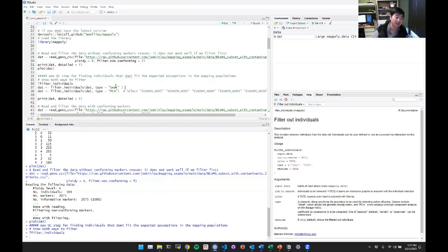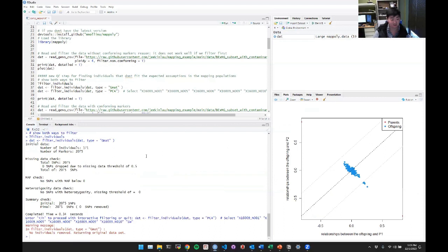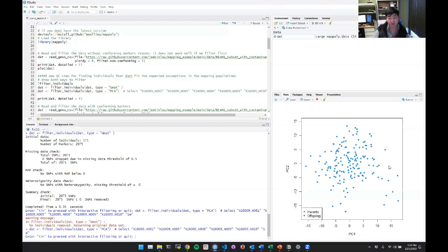And it would use a G matrix that's calculated from AGH matrix. This is an example of it. But you see these guys that don't belong over here, they're kind of close, and it could be that they belonged in here, but it could not be. Also, if you just ran it using PCAs, you really can't tell in the point cloud what belongs and what doesn't. So we're going to come back up here.